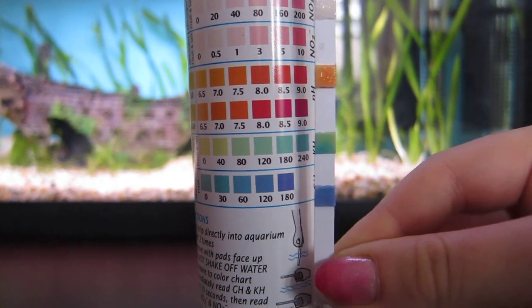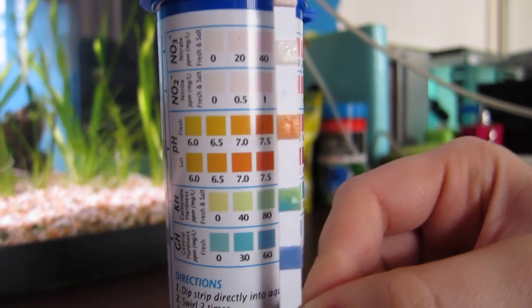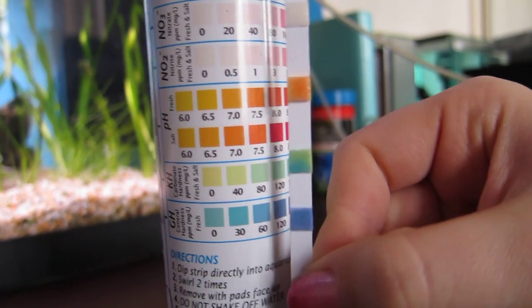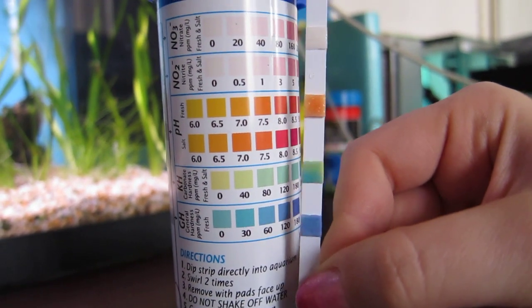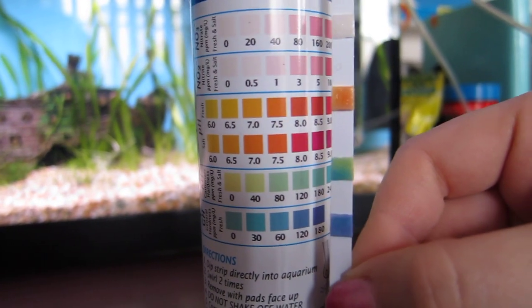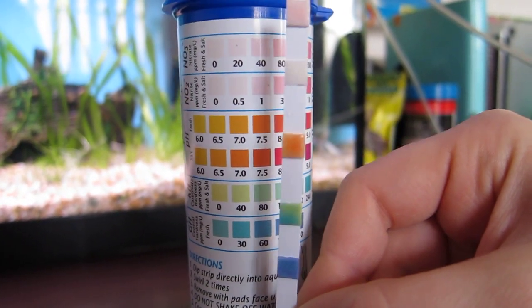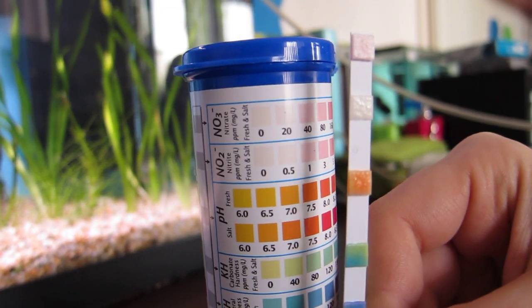The pH is around the top reading for freshwater, so I'm guessing it's almost between 7 and 7.5. The 8 reading looks a bit too dark, so that looks pretty good. The two top pads are nitrite and nitrate.